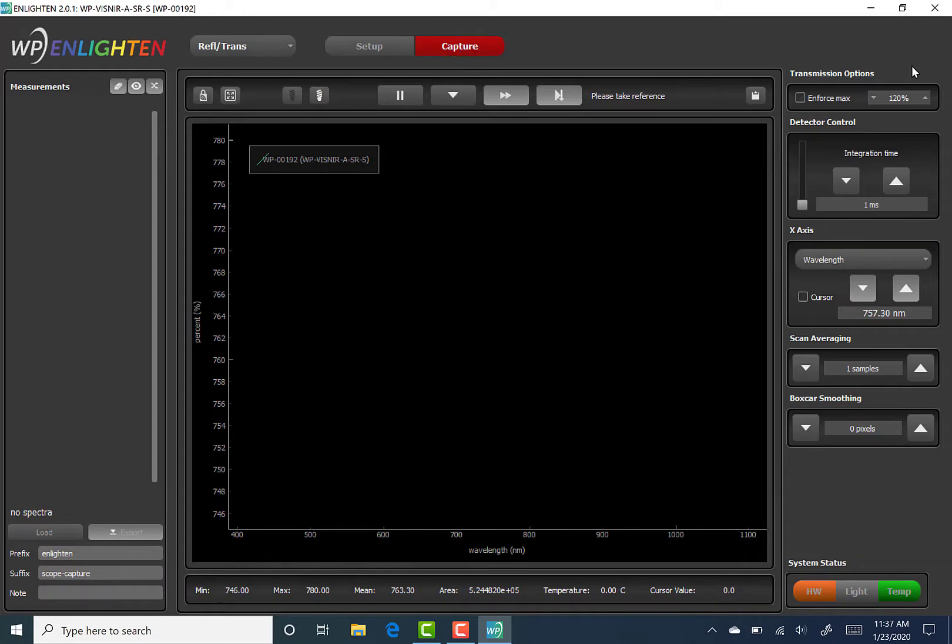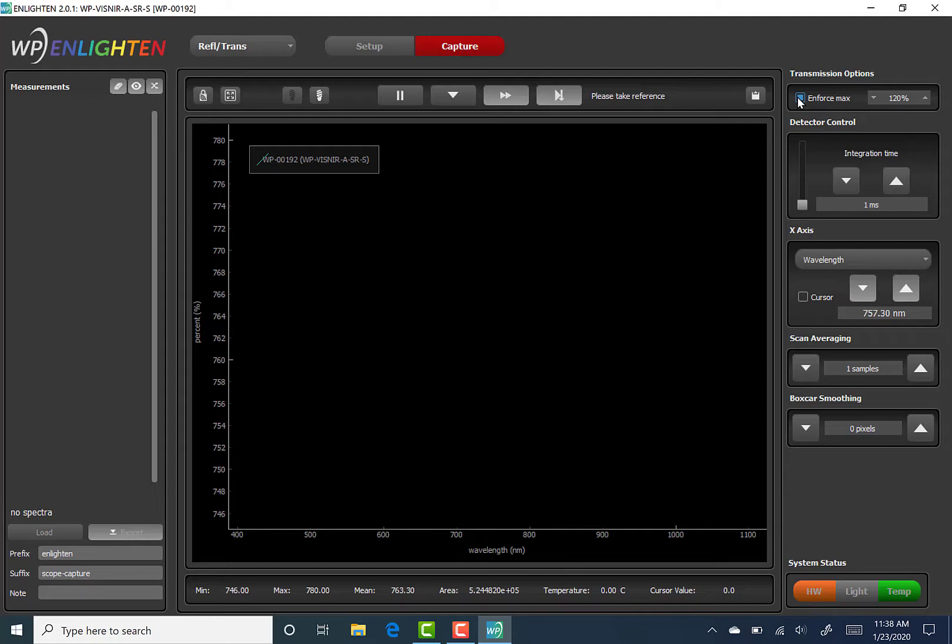In order to set the transmission scale to the Maximum Transmission, click the box to the left of Enforce Max. Instead of Maximum Transmission, you can use the up and down arrows to the right and left with the percentage value, like so. The numeric field itself is editable, so the user can easily click inside the box and edit the value directly.